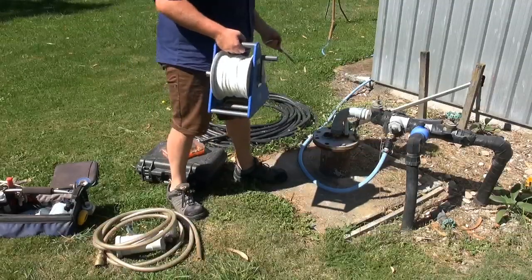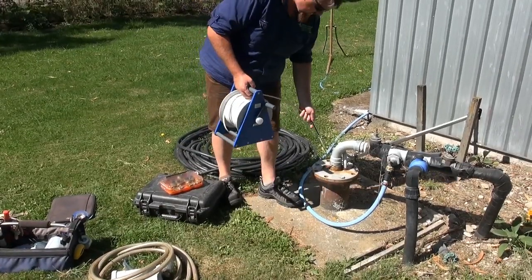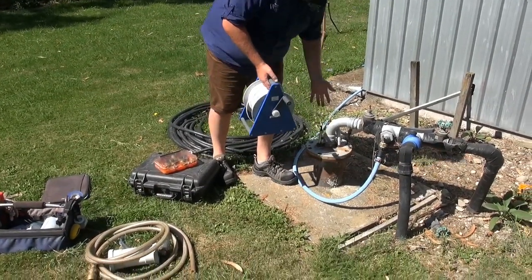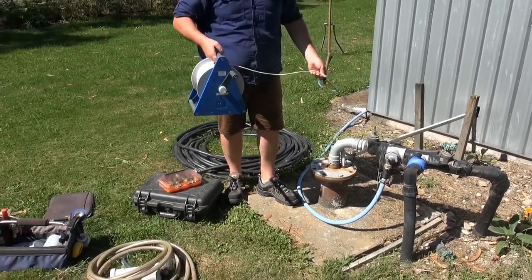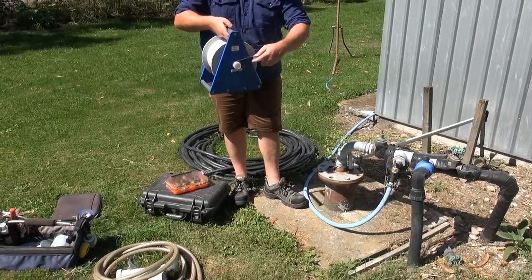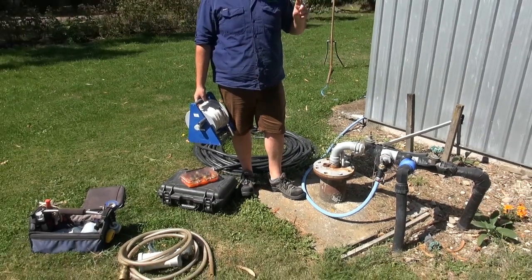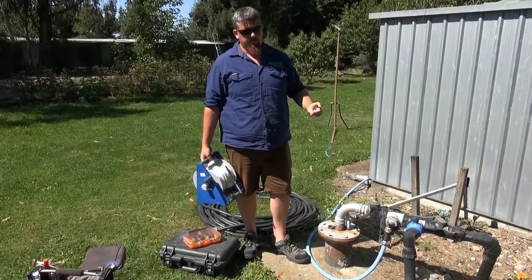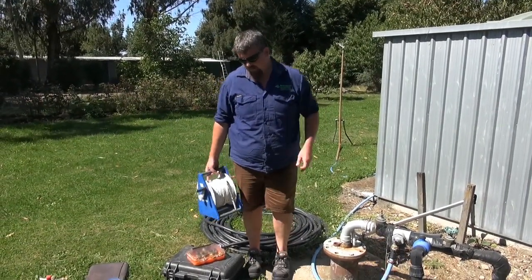To establish the purge volume you need to dip the well first by simply inserting the dip probe into the well and lowering it until it beeps and finds the water. Then you subtract that distance from ground level to the water from the total depth of the well to calculate the volume of water in the casing.